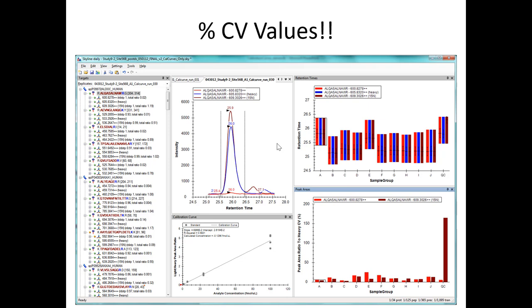You're saying that the order here can be anything you want it to be. When you import a bunch of data, it will be alphabetic, or however you imported it. But when you go into edit manage results, you can change the order to whatever you want. Yeah, but not, this is grouped. So grouping goes alphabetical, and then number-wise, if you have 0.1, 0.001, and 0.001, those will go first, and then anything that's 0.02, 0.2. That's because normally I would group by concentration, so I don't have to have a key to remember what B and C and those numbers are.